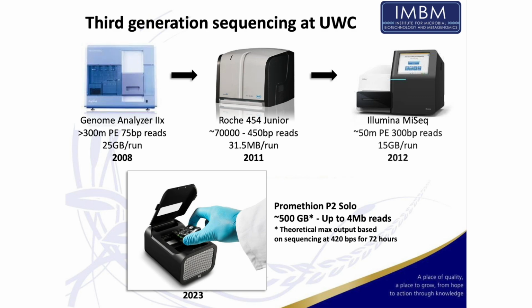Then we fast forward to 2023, and over the last sort of 10, 15 years, there's a company called Oxford Nanopore Technologies. Their technology is revolutionary. It doesn't do what any of the other guys used to do, and I'll explain to you towards the end of my talk exactly how the sequencing works.